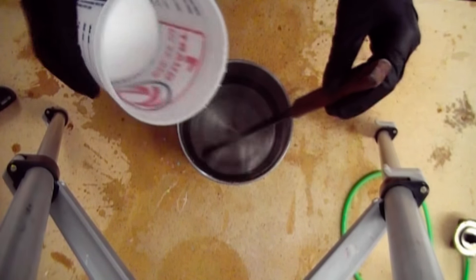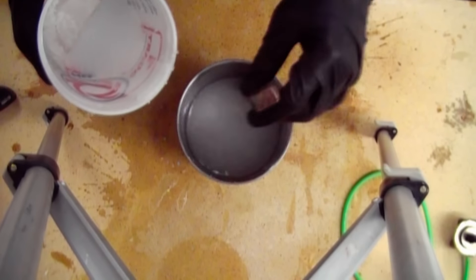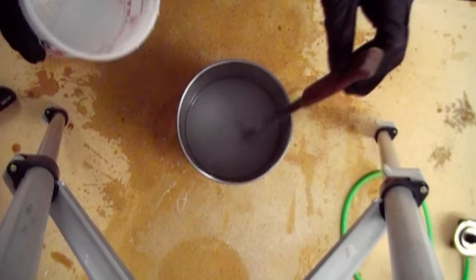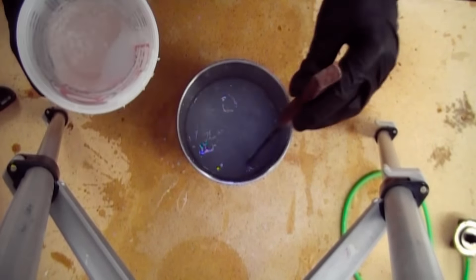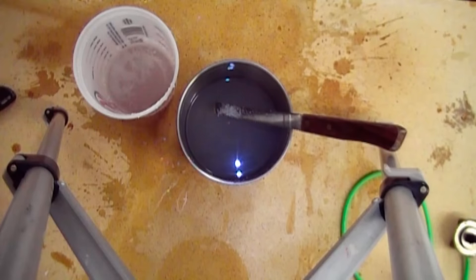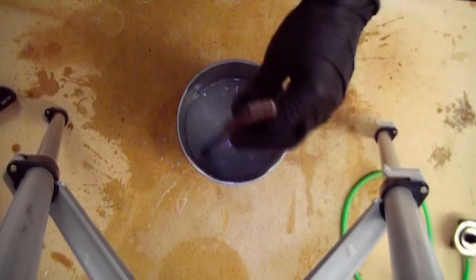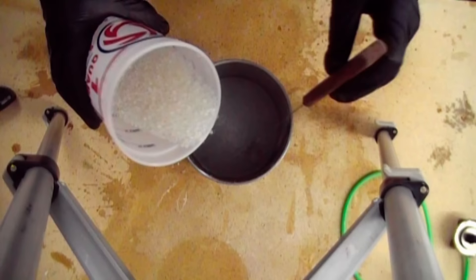Begin slowly adding the sodium hydroxide to the water. Go slowly, as this will generate considerable heat. Once all of the sodium hydroxide has been added to the water, begin adding the silica gel. The addition of the silica gel will also generate heat, so go slowly.